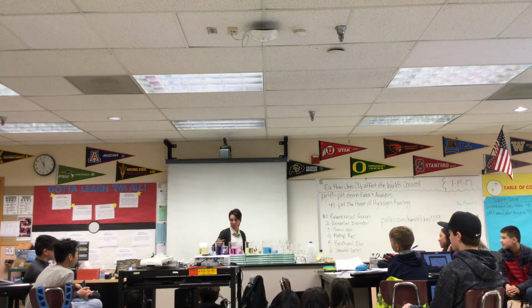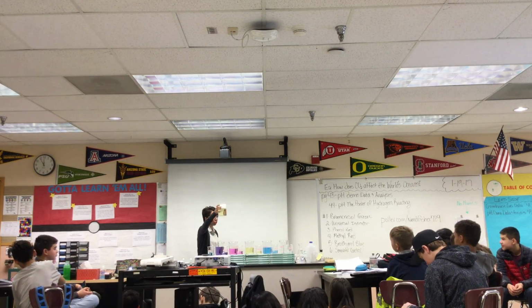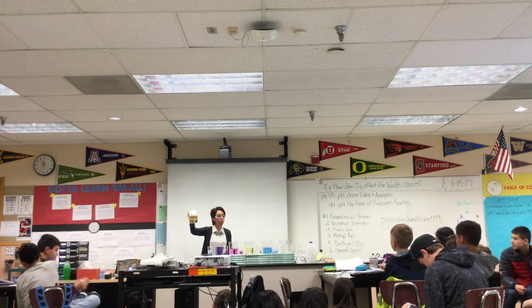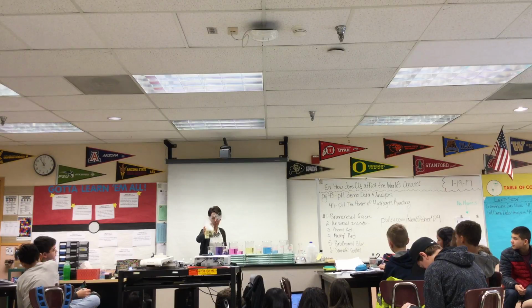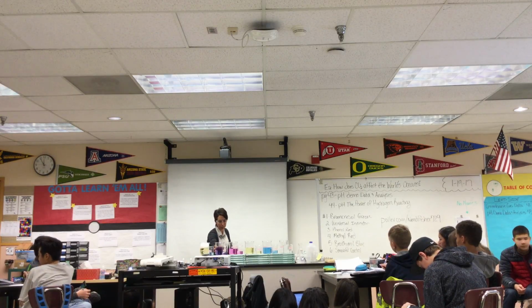All right, there we go. And there's our final ending color, right? So now we have that nice yellow. So based on your chart, what is the pH at least now? 3.8 would be the low end, right? 3.8. And once all the dry ice is done, I'll have someone come up and use the pH meter and take our final pHs.